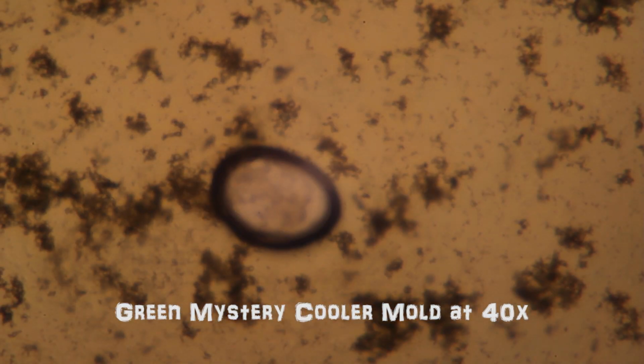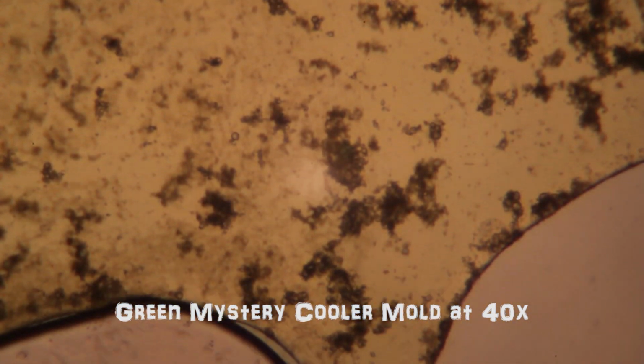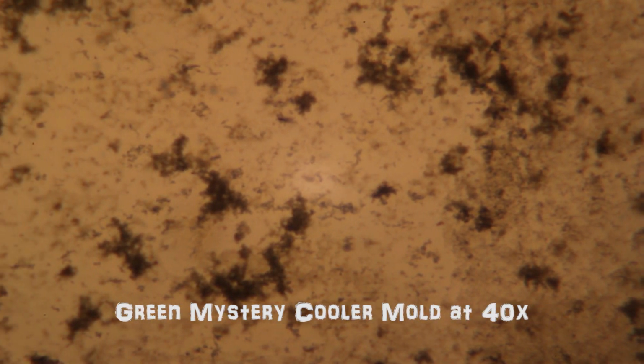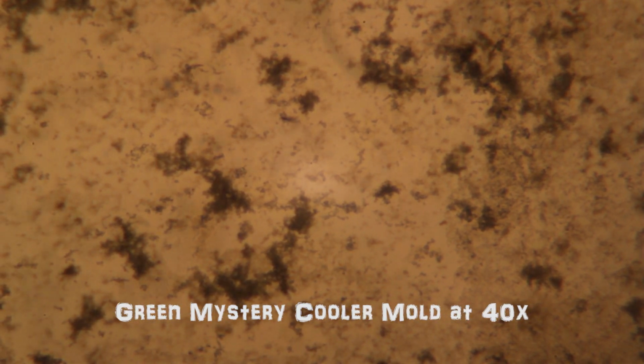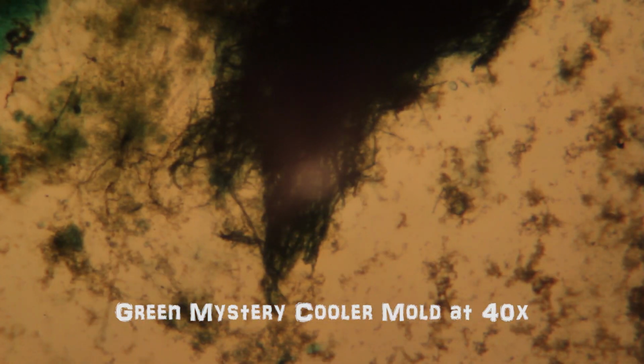Okay, here's the green mystery cooler mold at 40 times magnification. This is the stuff that's going to be more fibrous, and what we're looking at right now is the sample suspended in water, kind of on the outskirts of the main sample. Getting in a little closer here to the main sample, this is where you'll see a lot of the fibers. And you can definitely notice the green color under the microscope.